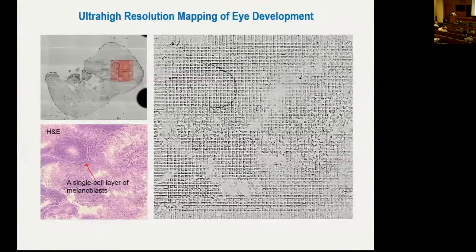As I told you, in the same tissue, after the barcoding and before the sequencing, we can even just under an optical microscope see individual pixels over here. And then when my postdoc showed me this image, I thought, okay, you've got a white fiber over there, very likely because we saw this when we used microfluidics before.